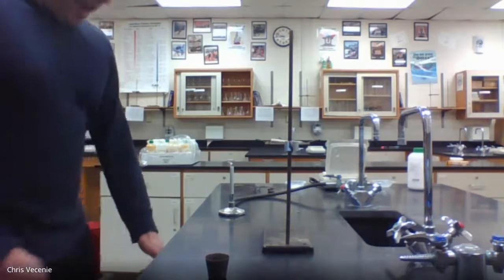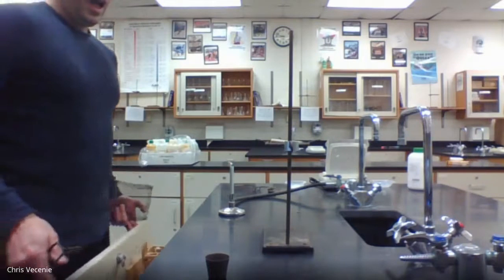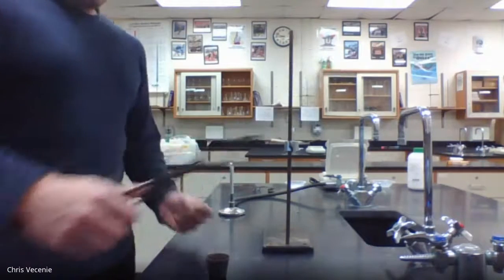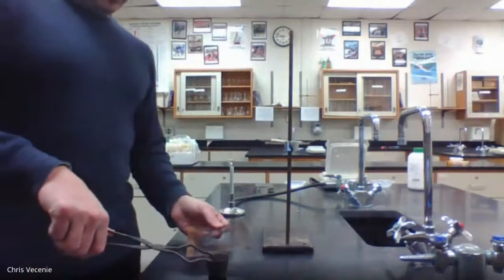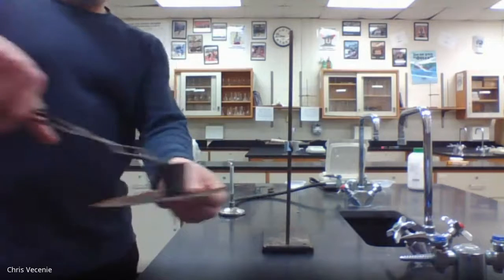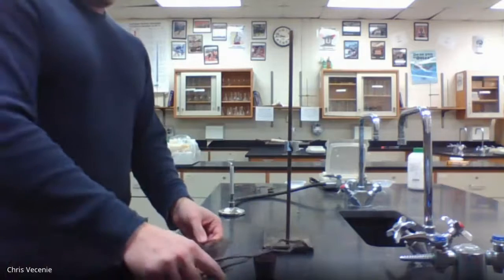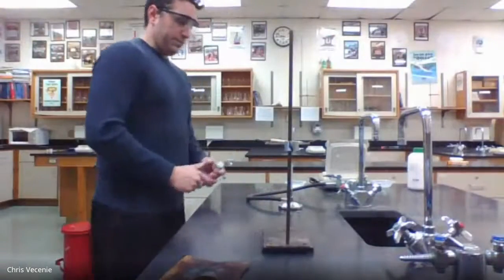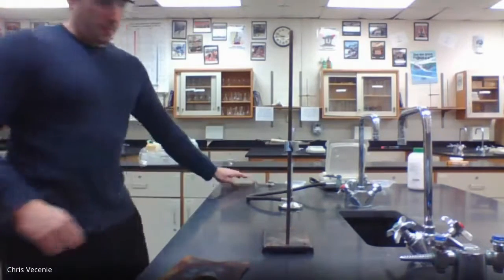All right. When I handle my crucible, I want to always use my crucible tongs, my wire gauze, okay, so that I can always grab the crucible like this and move it as a singular unit like this. And then the lid could always stay on the side. Okay. All right. So if my nose is smelling correctly, I think we're good with our methane. There we go. All right.